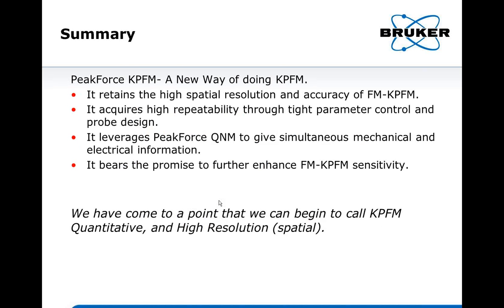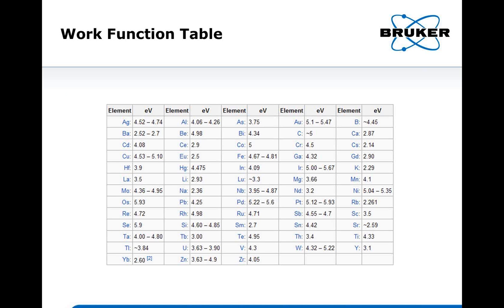So now we believe we have come to a point where we can begin to call KPFM quantitative, and of course it's high resolution. Let me switch. I know we are approaching the end, I'll run a few more minutes, a couple of minutes, to switch gears to a different mode.